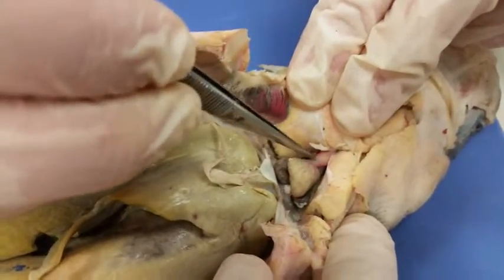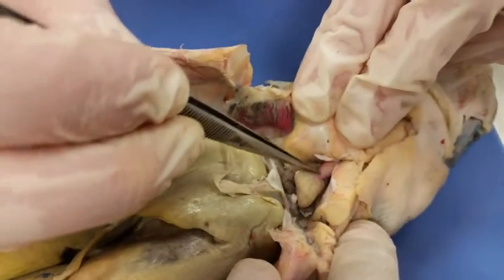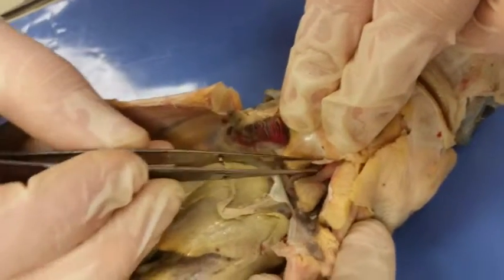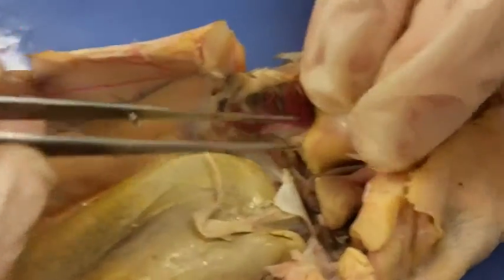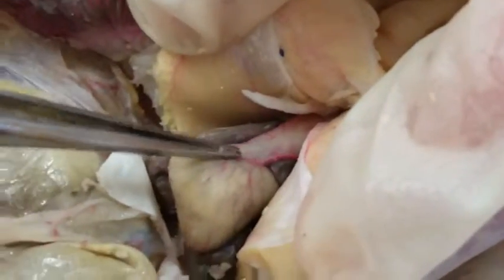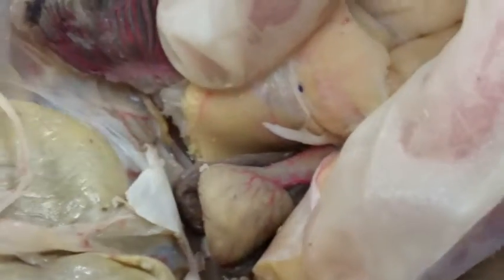Leading down right through here, we have again a conus arteriosus. And running up along either side here, you can actually see the coronary arteries that feed the heart with blood. You can see the pink right through here. That's a coronary artery. There's some on either side of the conus arteriosus. And then surrounding is just the sinus venosus.